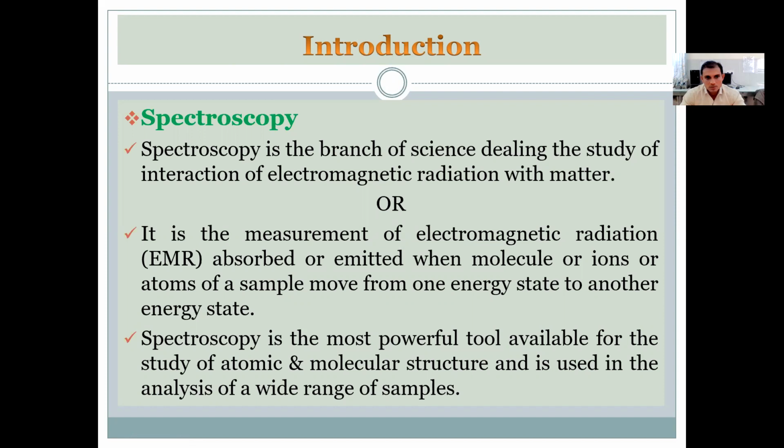It is further defined as a measurement of electromagnetic radiations, EMR, absorbed or emitted when molecules or ions or atoms of samples move from one energy state to another energy state. If atoms in the ground state absorb some kind of energy, they will go to higher energy states.